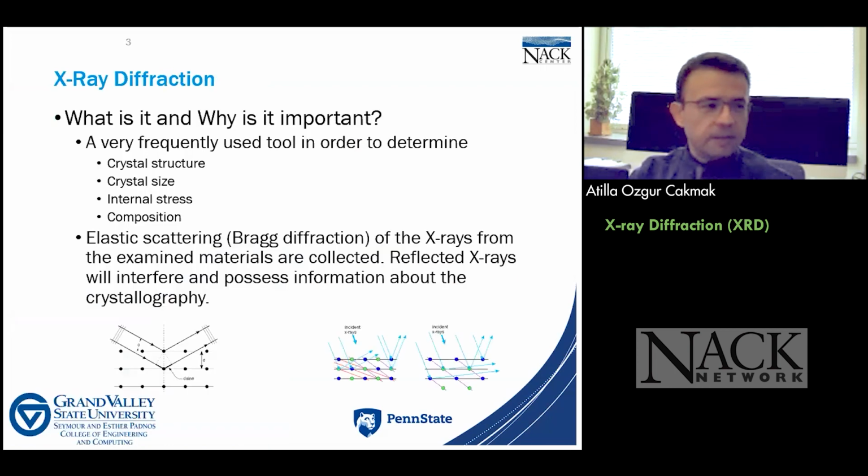Okay, so first, X-ray diffraction. Peter already gave us a great introduction, so we'll go back to the summary about where it's going to be used. But the main idea today will be to use some tools in our classroom to teach the students the fundamentals, or give them a chance to touch and feel what this X-ray diffraction is all about.